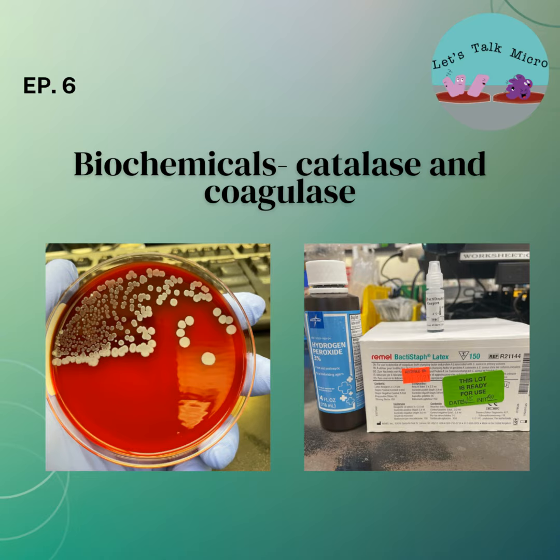Remember, motility is the movement of bacteria by flagella. So when you have a Bacillus, you need to rule out anthracis. If you have a non-hemolytic Bacillus, you look for motility because Bacillus anthracis is non-motile. And you can do it different ways. I talked about how you inoculate a trypticase soy broth and incubate that for 24 hours.